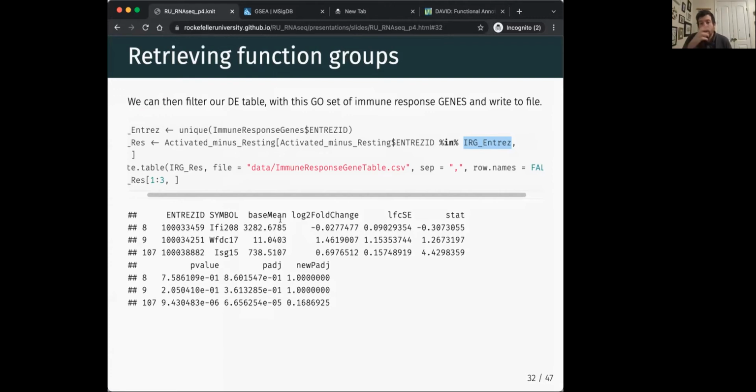When you do your analysis, you can save this session information from your R session. And so when you're finished, you can reproduce everything you're doing super easily. And so this means that if you come back 6 months from now and you run it again and you get a different result, you can explain why.